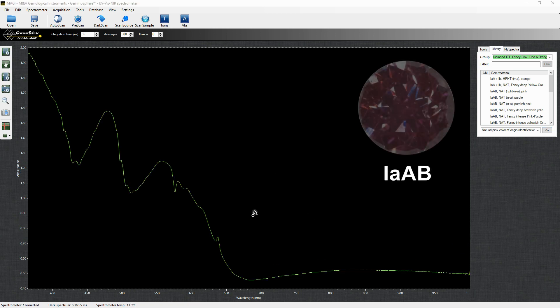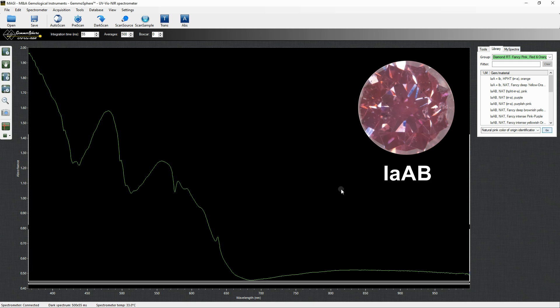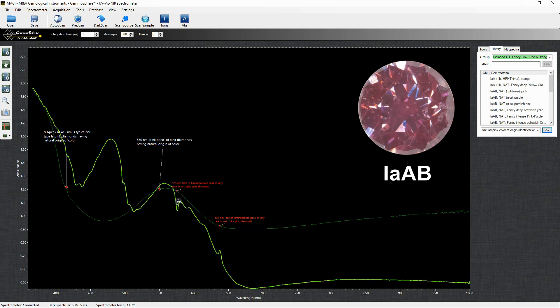This stone is a natural multi-treated pink diamond. This band mimics the pink band, but the real cause of the color is another one. Along with the spectrum of natural pink, here you can see the two references of the peaks of 575 and 637 nm caused by nitrogen vacancy defects, which are responsible for the body color of this stone.